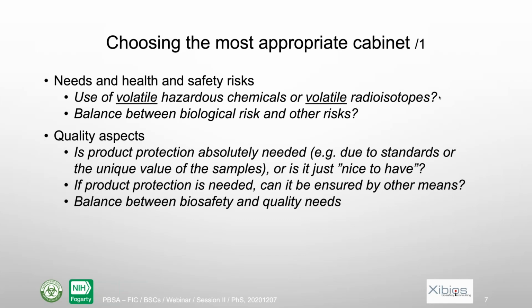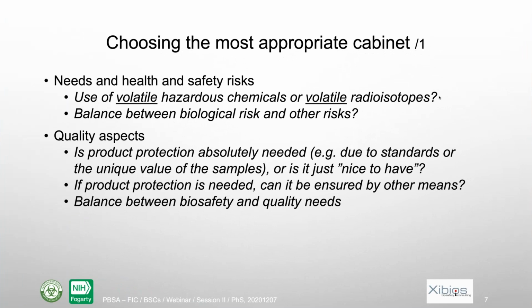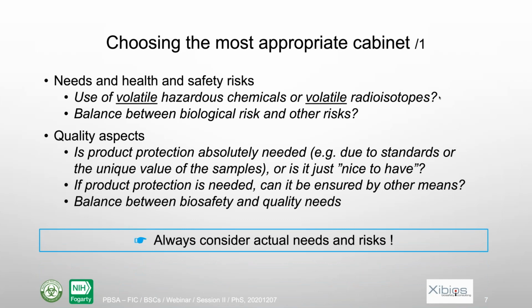And then also, if you need product protection, you could think about other ways to ensure it, also using normal practices under a class 1 biosafety cabinet, for instance. So again, with respect to quality versus biosafety protection, you need to weigh both sides and decide accordingly. You always need to consider the actual needs linked to your activities and the risk from your activities.